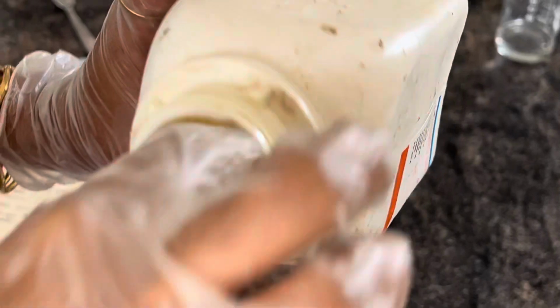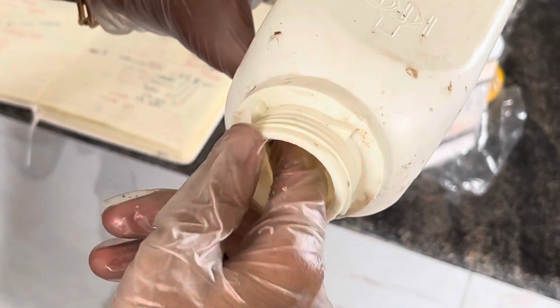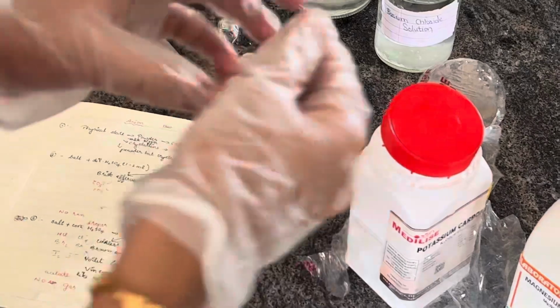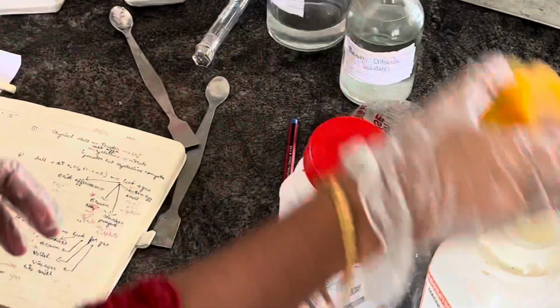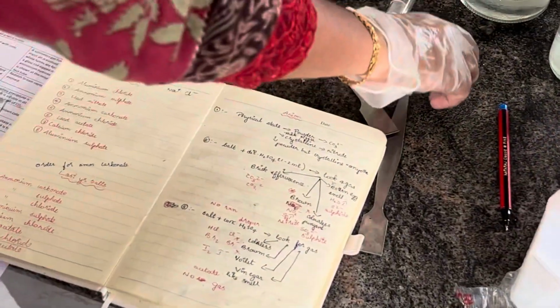So in this way we can get an idea whether it is nitrate or any other salt. See the texture of nitrate, it is crystalline, you can see, right? It is a crystalline structure in the case of nitrate. And we will be estimating anions like carbonate, chloride, then nitrate, acetate, sulphate, etc.